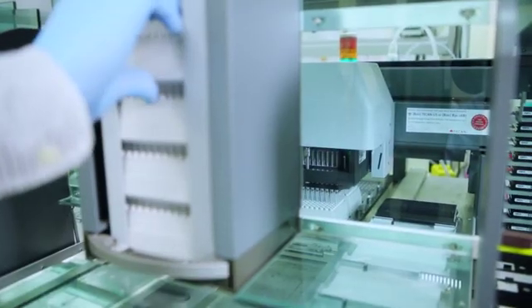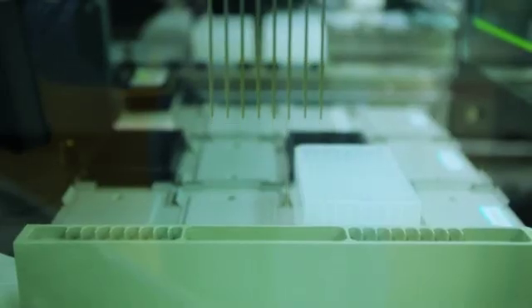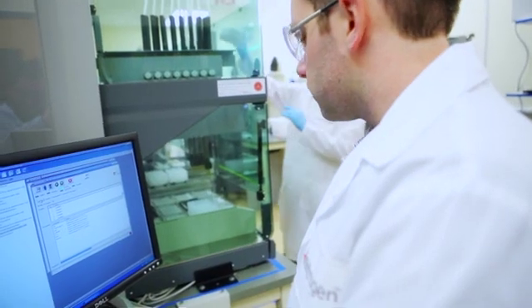We're able to meet customers' expectations for accelerated turnaround times through robust processes, high quality systems, dedicated personnel, and a strong infrastructure of automation both in the lab and along our workflow tools with our informatics.